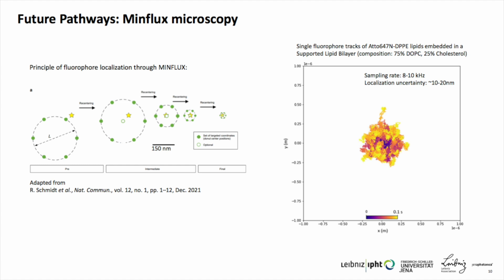Please notice that the localization uncertainty that we report here is related to the analysis that we performed before and not to the theoretical resolution limit of MINFLUX.